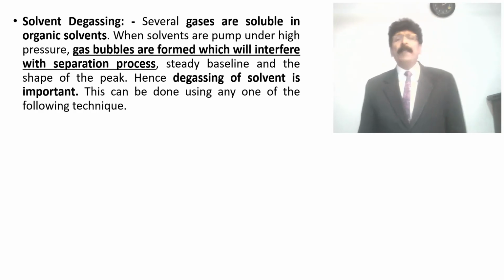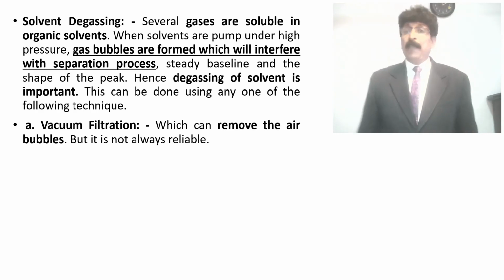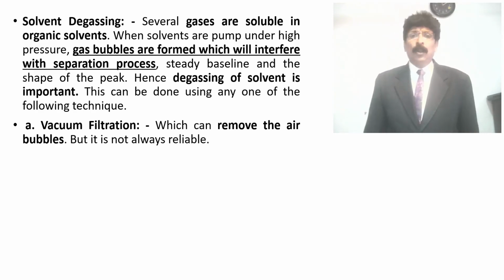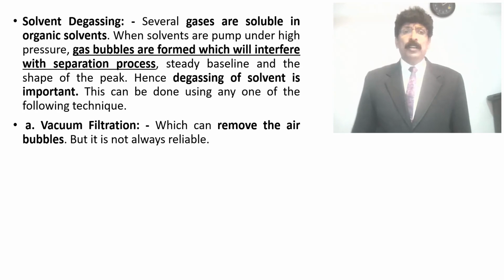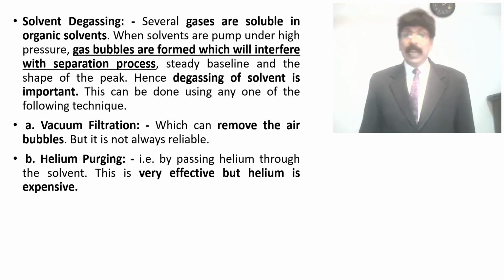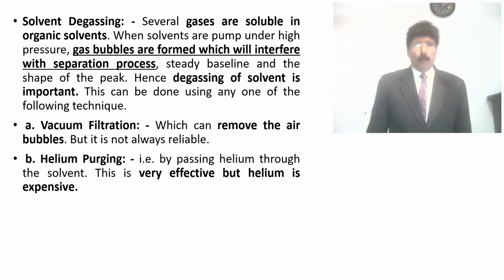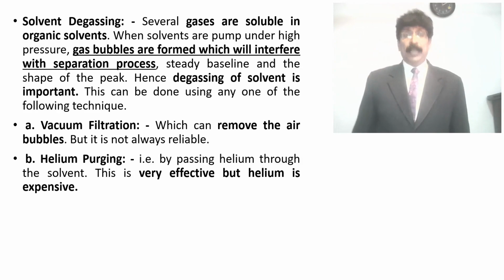This can be done using any one of the following techniques. One is vacuum filtration, which can remove the air bubbles but is not always reliable. Helium purging: passing helium through the solvent is very effective, but helium is expensive.